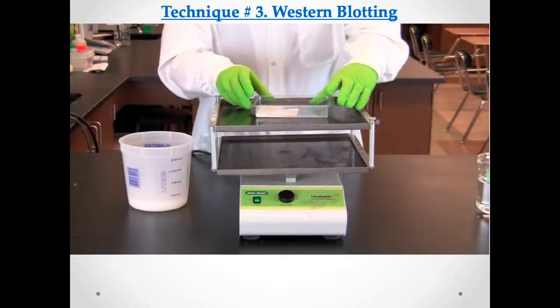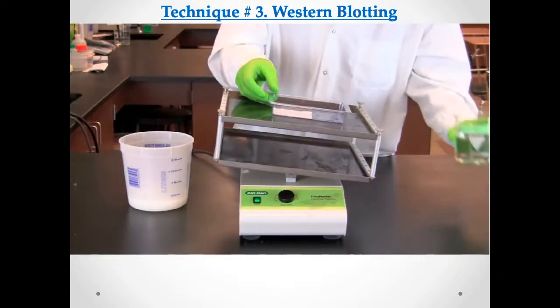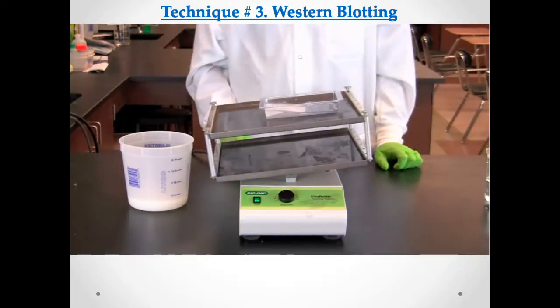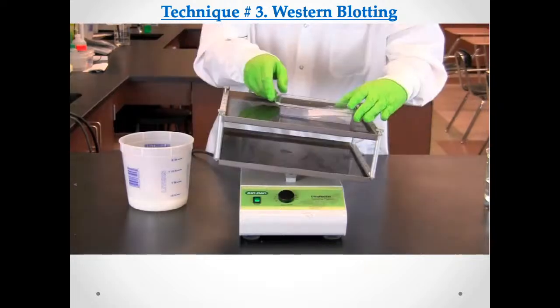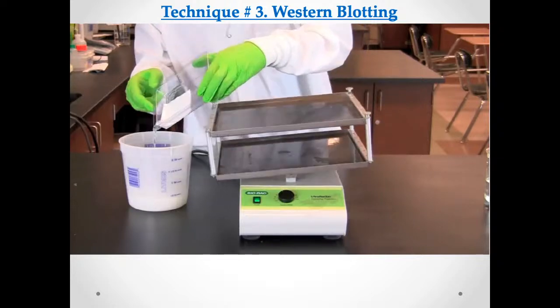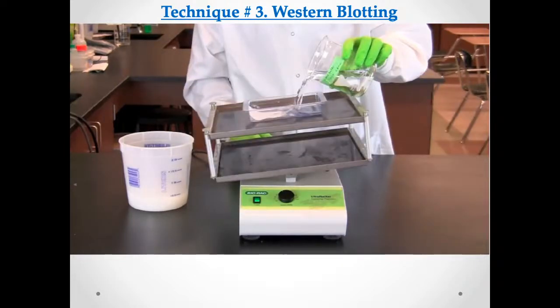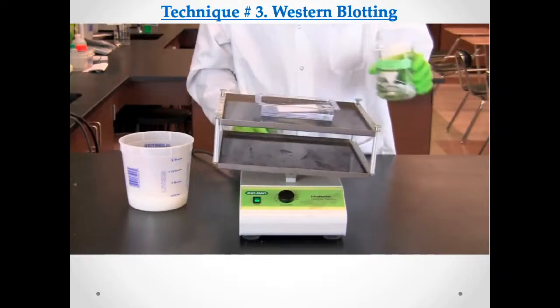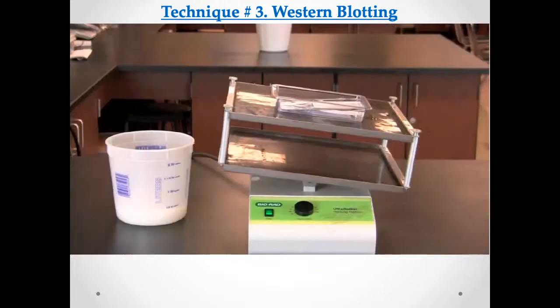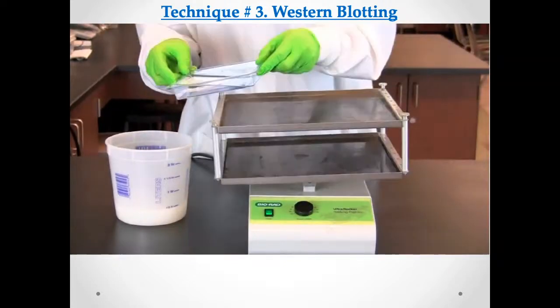Pour off the secondary antibody. Rinse the membrane quickly in 50 milliliters of wash buffer and discard the wash buffer. Add an additional 50 milliliters of wash buffer and wash the membrane for 3 minutes on the rocking platform on a medium speed setting. Discard the wash buffer.